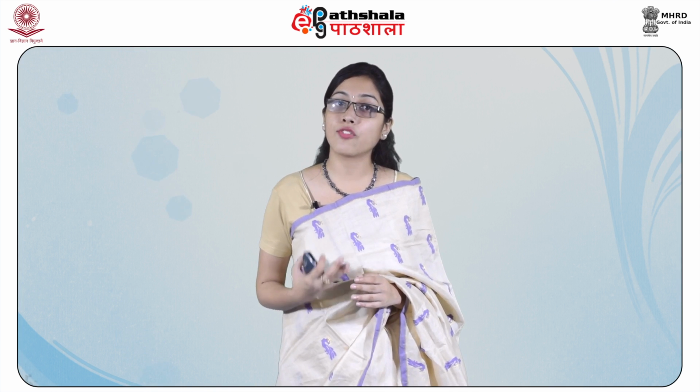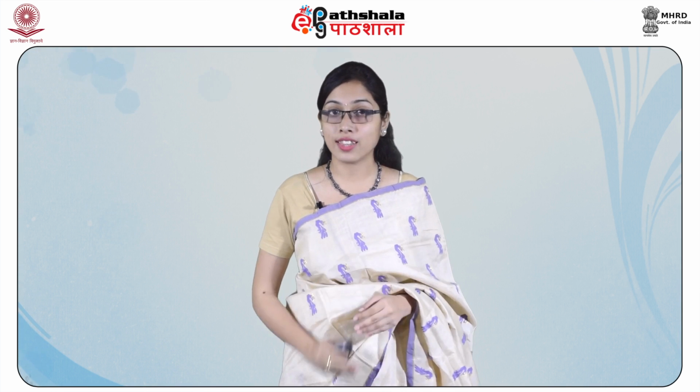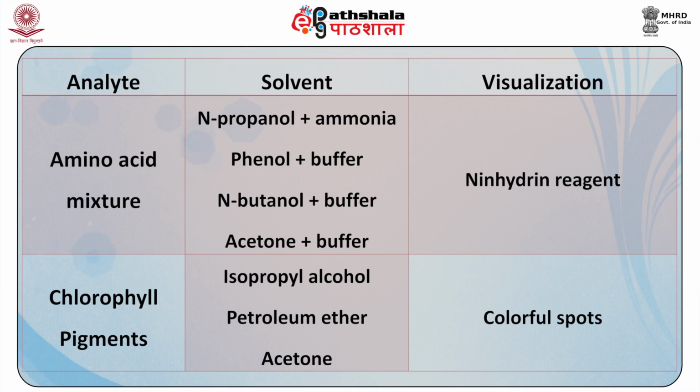A few examples of paper chromatography applications and their analysis are shown in this table, where one column has the analyte component, the next column shows the solvent, and the third column is for the visualization reagent. First, starting with amino acid mixture, the different solvents which can be used are n-propanol with ammonia, phenol with a buffer, n-butanol with a buffer, and acetone with a buffer.